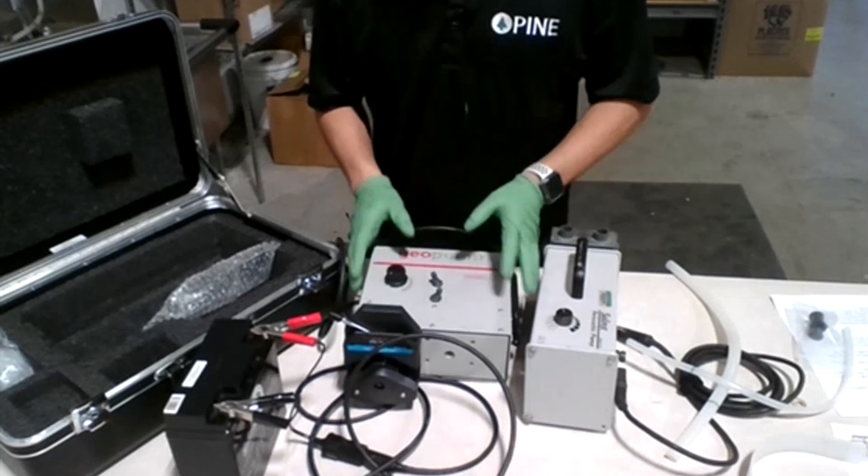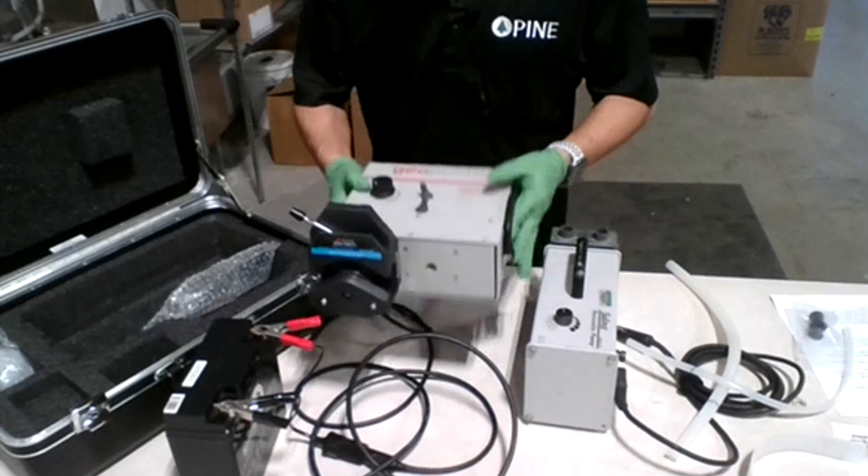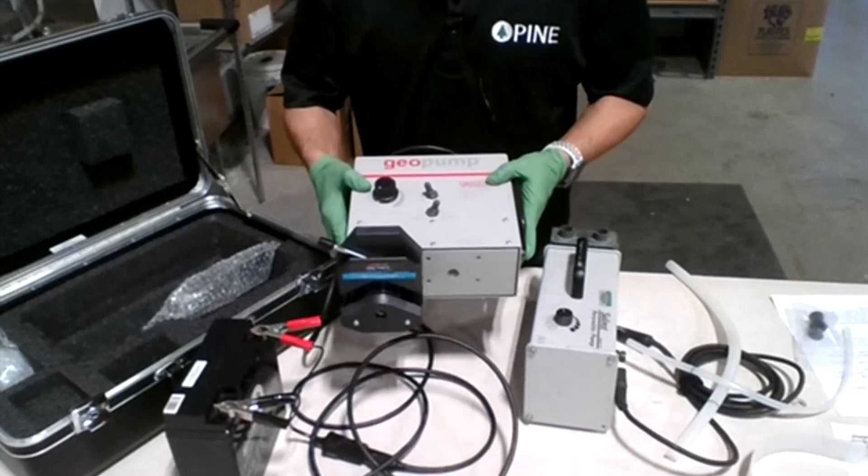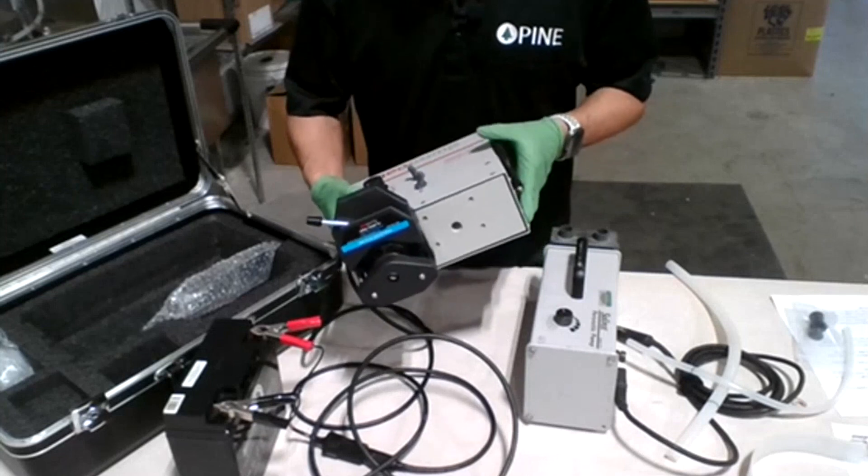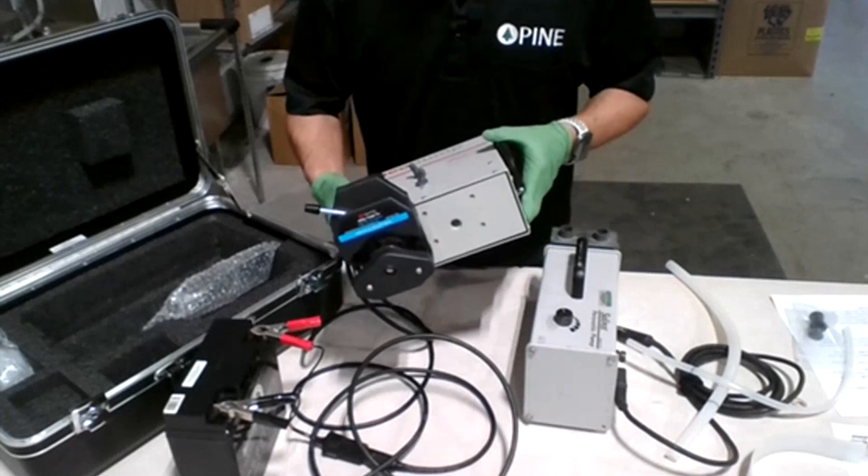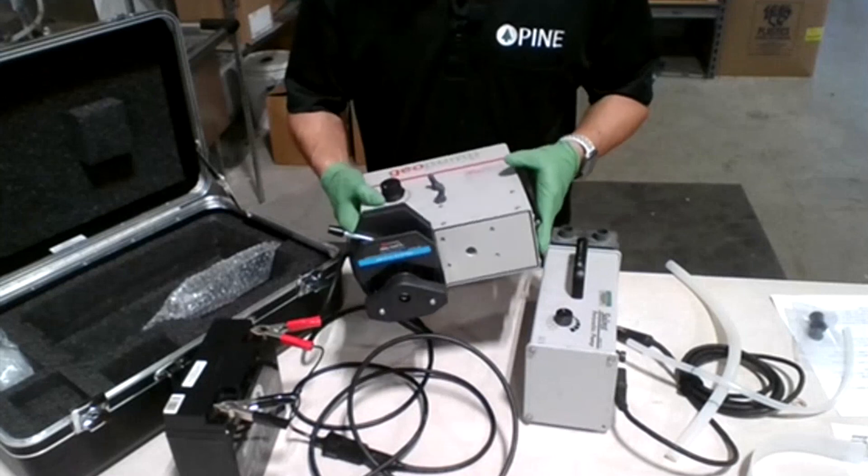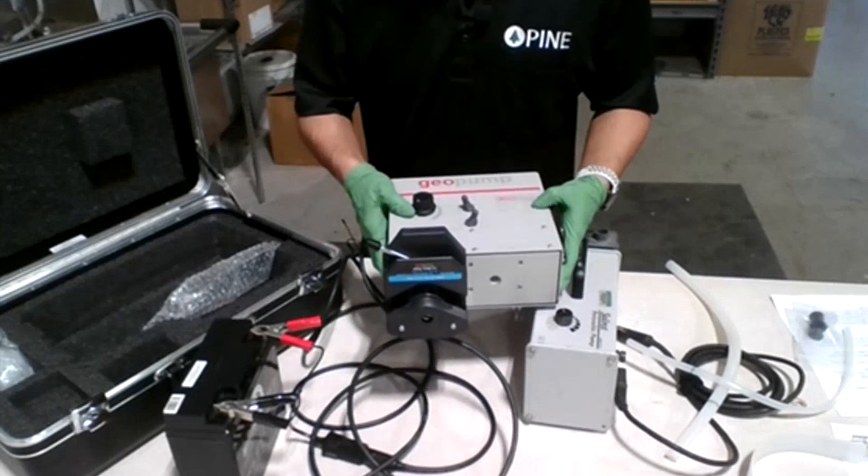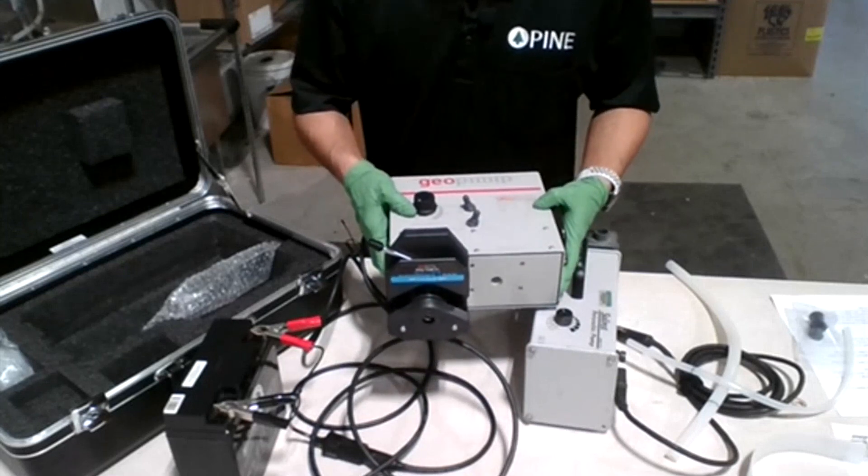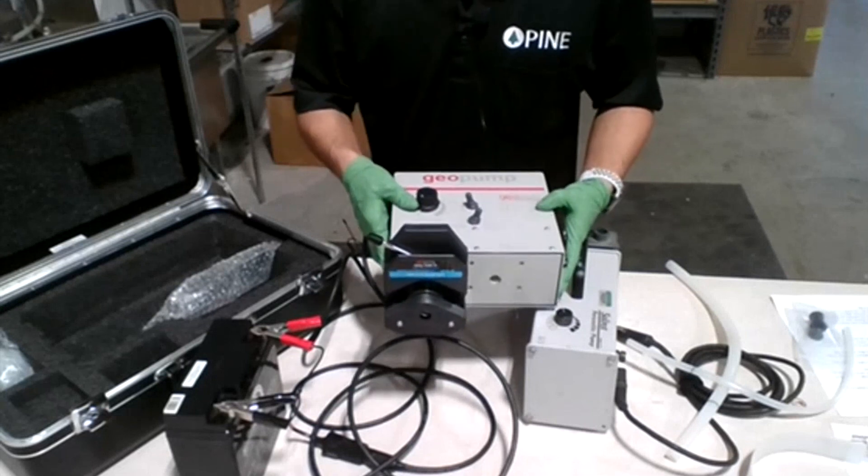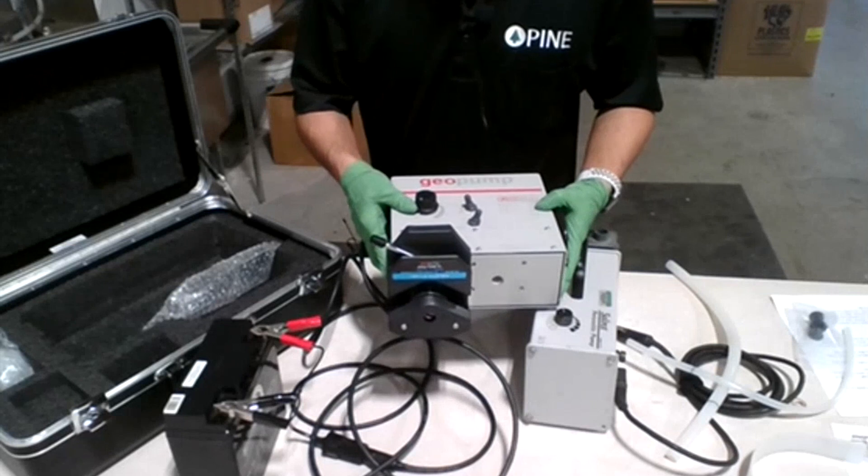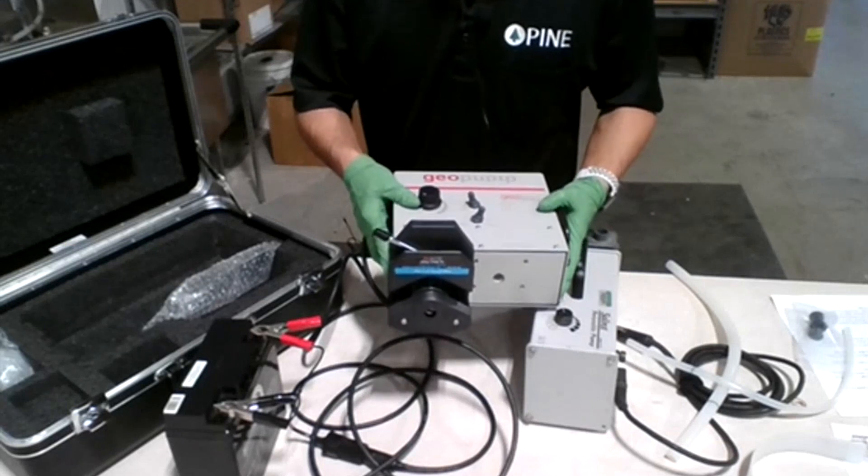This Geotech pump can go as deep as 27 feet, that's like 8 meters or so. You can use it down to that depth. You can see it's very handy to use in shallow waters, or if you're drawing back from a river or a lagoon, you can do that with no problems.